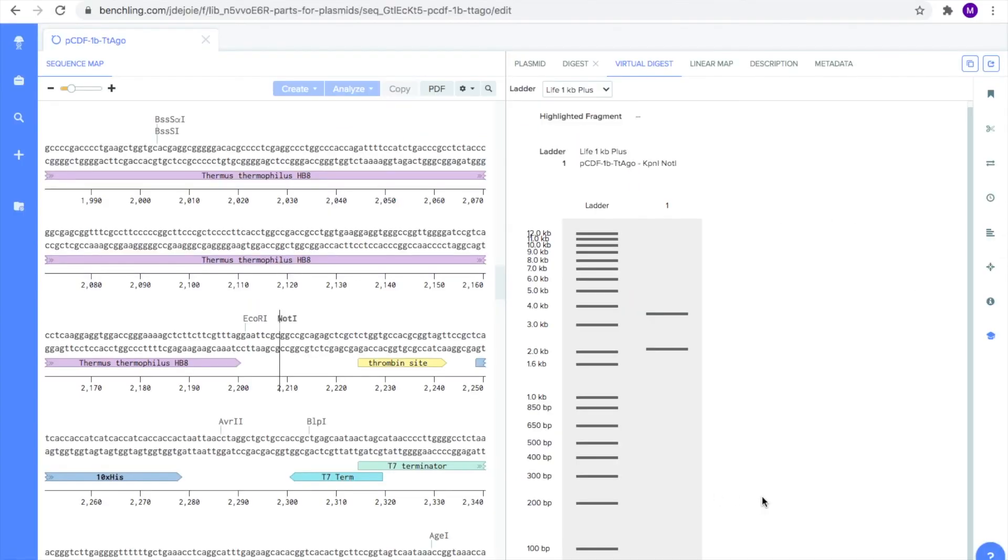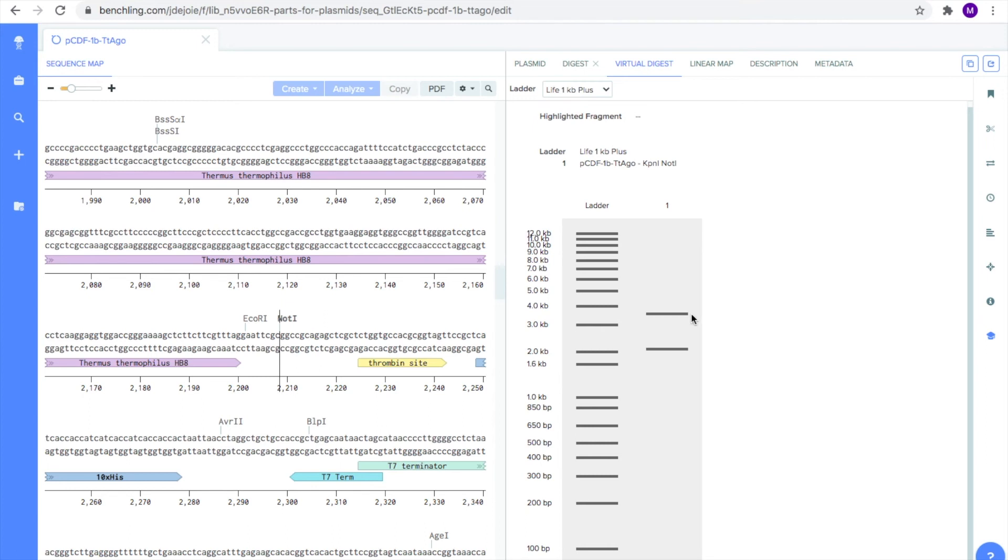What you see is an agarose gel with a ladder. The ladder provides a reference as to where fragments of certain lengths will be located on the gel. In column 1, you will see where the expected fragments from the virtual digest we just ran will be located. As you can see, there are two bands present which correspond to the two fragments produced by our restriction digest.